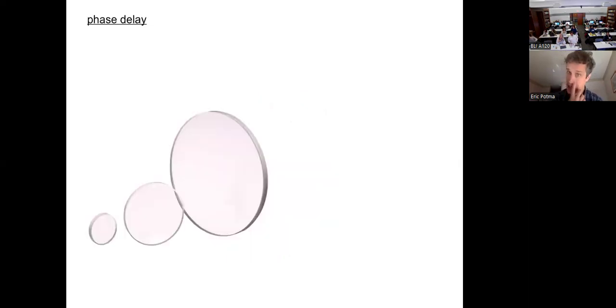The simplest way is to look for a contrast mechanism that is offered by sending light onto your material that affects the tissue in the least possible way. So here's one example, the so-called phase delay, and everybody's familiar with it. You have here, for instance, a piece of glass, light goes through it, so that means nothing gets absorbed, okay?